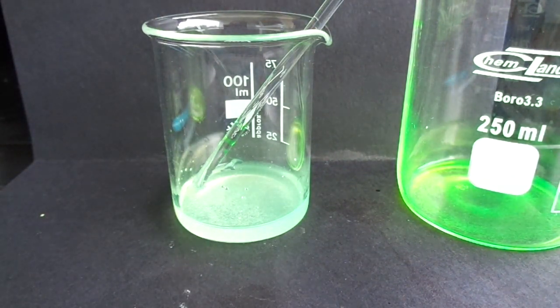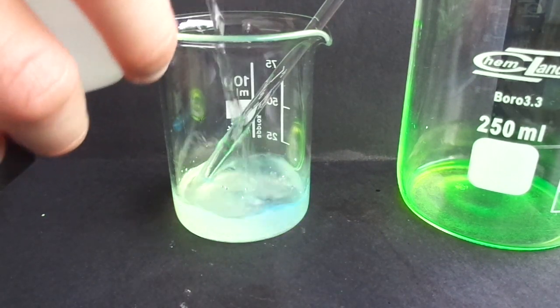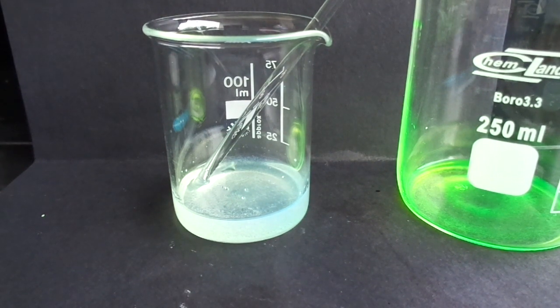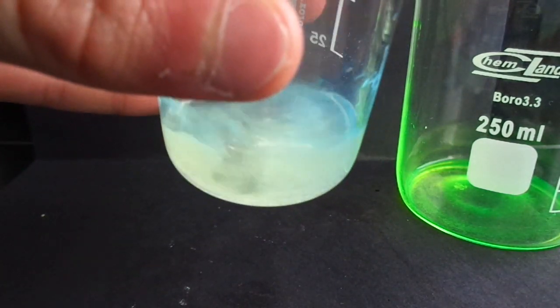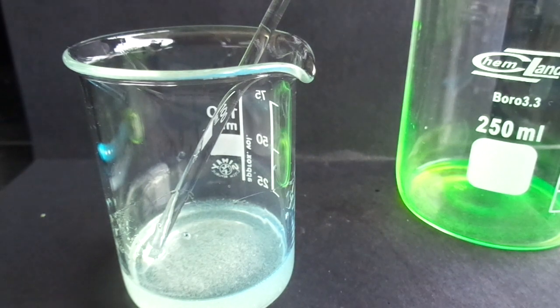Now I will dilute it with isopropanol. As you can see, the color is now kind of blue — more than green. So that's going to be perfect because it still has its fluorescent properties.